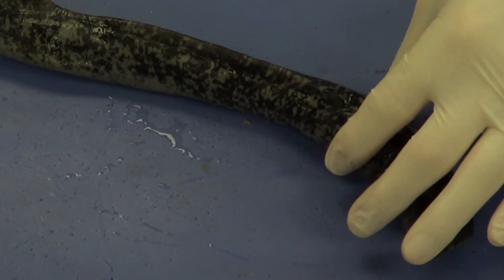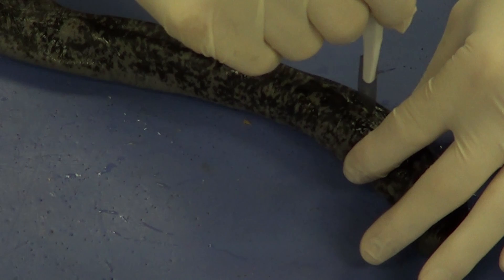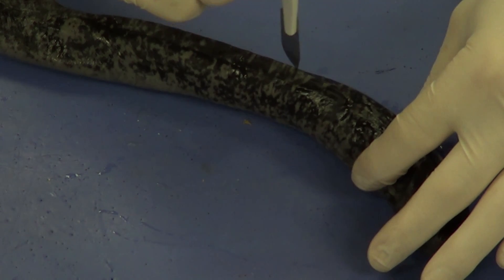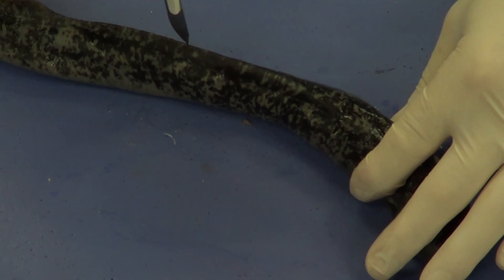Once you do that, turn the lamprey around. You want to cut away from your hand again. Put your scalpel in where you left off and continue midline, bisecting or splitting the dorsal fin all the way down until you get to the end.